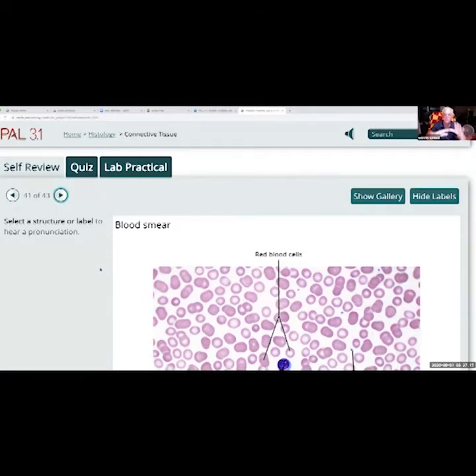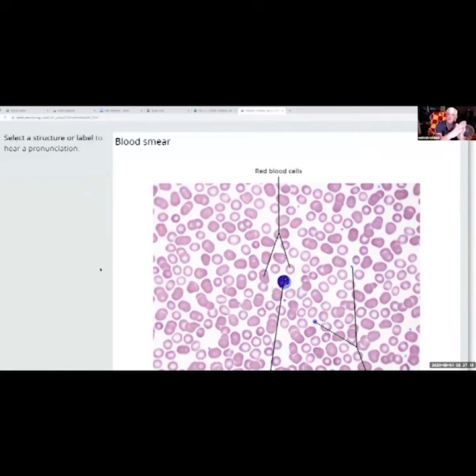You have to remember the shape of a red blood cell is a biconcave disc. So it comes out and swoops in. Depending on how you did your section and how the red blood cell gets cut through the section, some of it shows the inner portion, which is very thin. Some shows the outer portion, which is very thick. So it depends where the red cells are being squished and stained. It just depends how they're rotated.